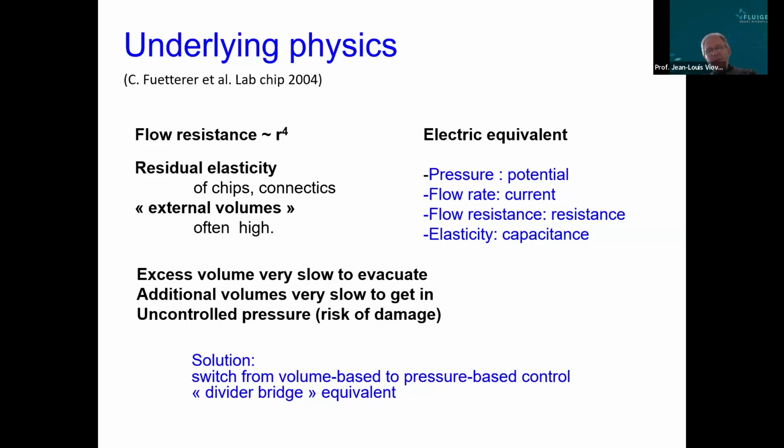And oppositely, when you start the syringe, you first build up additional liquid by deforming the system before it can go to the channel. And in addition, this can give some non-control of the pressure, which can damage your chip.